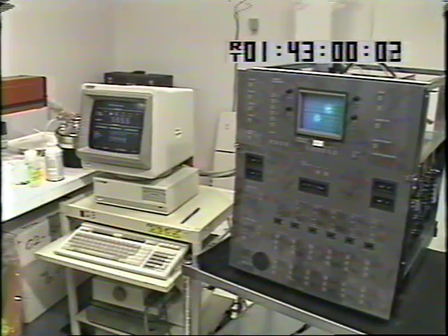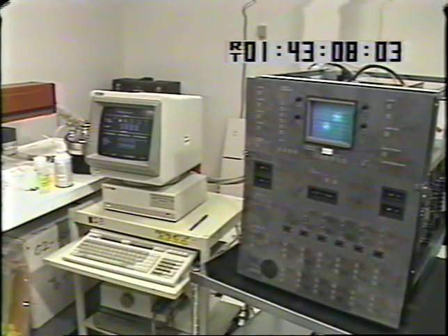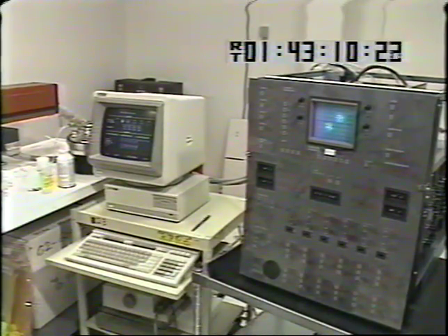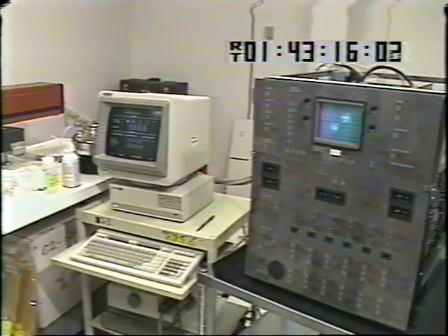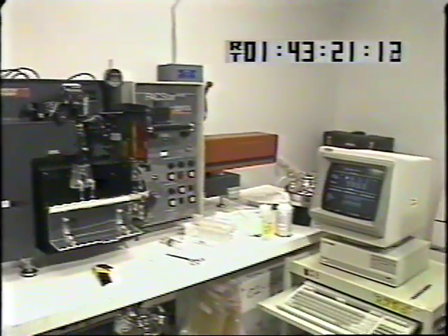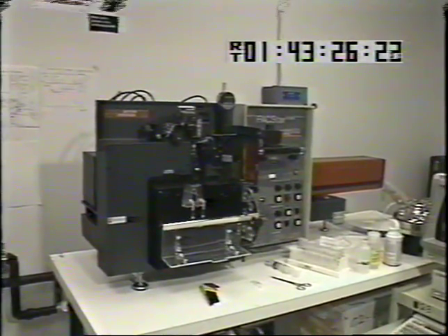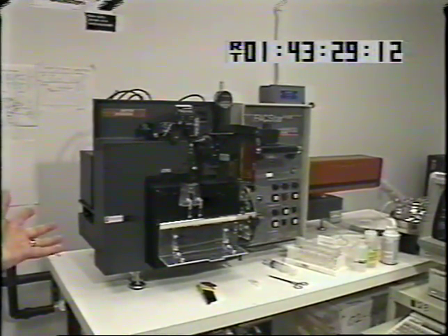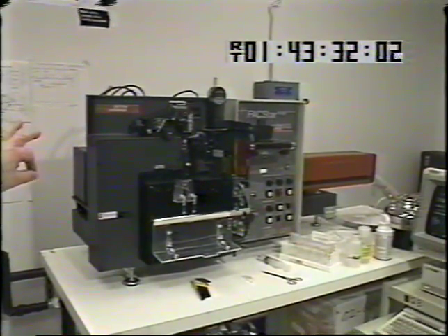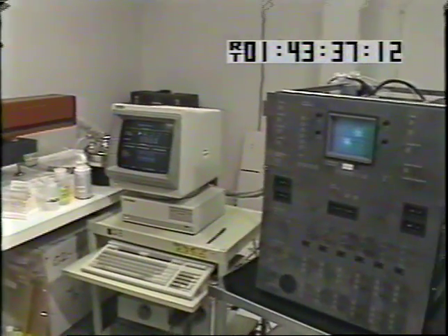We can set thresholds such that we can select individual cells and collect them separately for the researcher to take to another part of the operation to do further experiments with the particular sample that he has got. So the electronics console is the mechanism that we use for setting those particular parameters. The whole process in this room is purely based upon the final alignment of the laser and the droplet stream and calibration of the electronics for the performance of the machine.